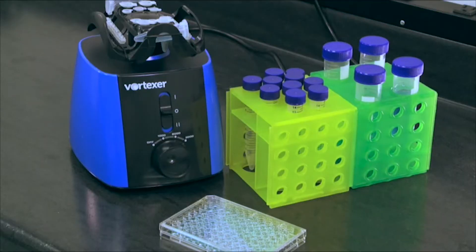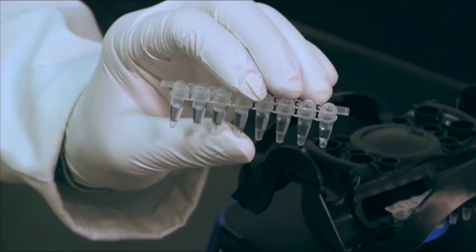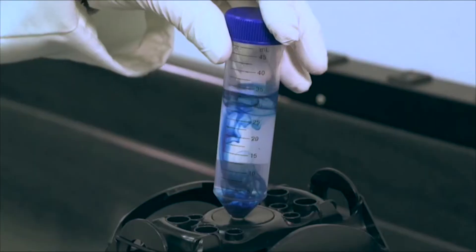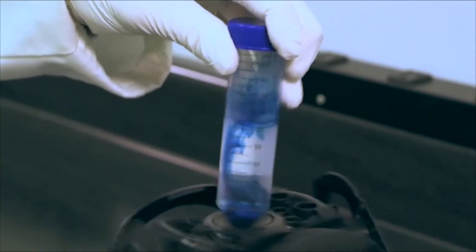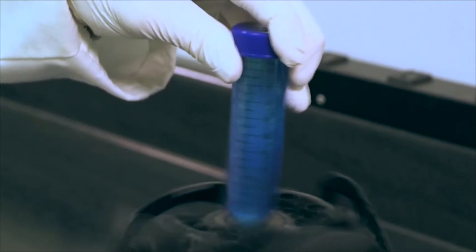This one mixing head can accommodate multiple tubes ranging in size from 0.2 milliliters to 50 milliliters, and also has room for a standard assay plate. And for those speedy single tube mixes, a center pad area can be used for quick touch operation.